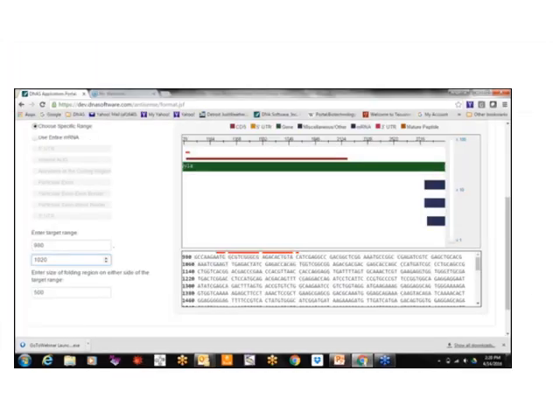After that, the results will show up, the sequences. Basically, we can target any sequence. Here, if we want to target, we just enter the target range, which nucleotide to which nucleotide we want to target.